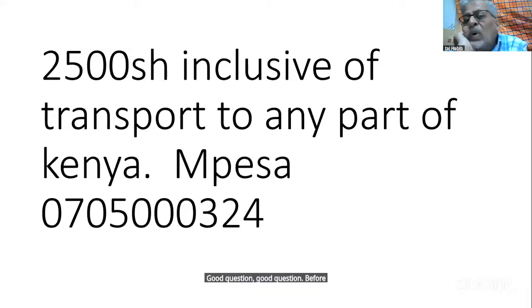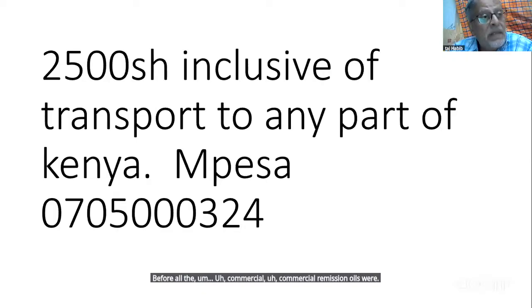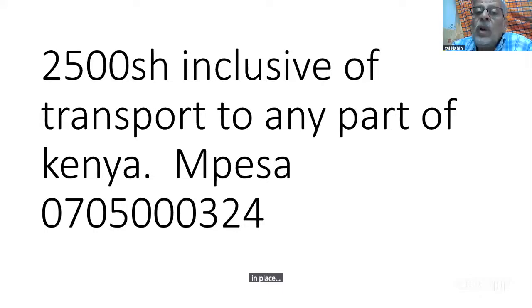What I want to remind you is that in the history of immersion oil, before all the commercial immersion oils were in place, castor oil was the one originally used.